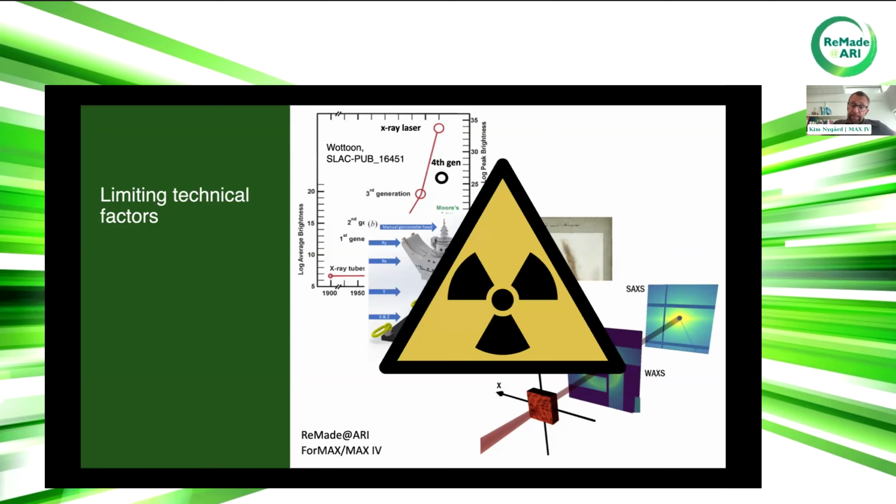A final comment is that, all well and good, but in the end, it's radiation damage of the sample that often limits how good resolution you can have. So this is something that always needs to be discussed with instrument staff in advance, discussing means of mitigating radiation damage, for example.